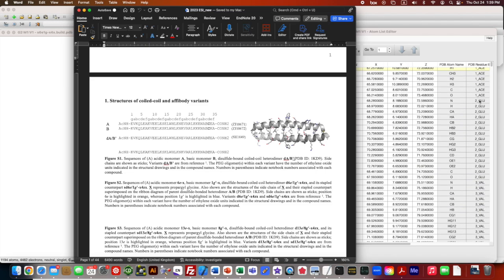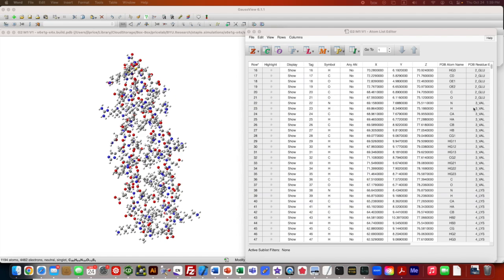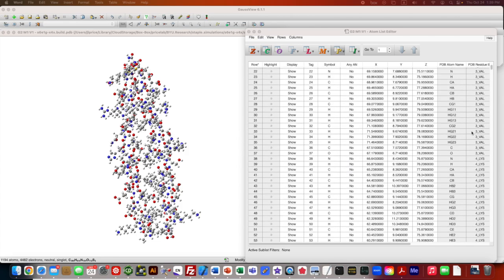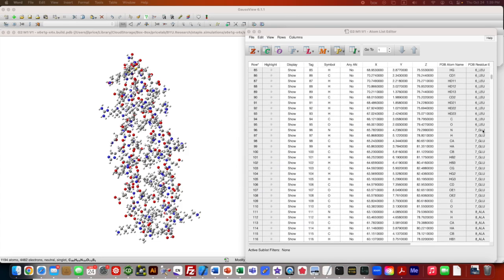So we want to modify the 6th amino acid here, and then we'll need to modify the first amino acid in subunit B. Does that sort of make sense? Yeah. All right, so navigating around, we'll go to residue 6. In the unmodified sequences, in the E position, glutamate, that would be glutamate 7 here, and there it is.